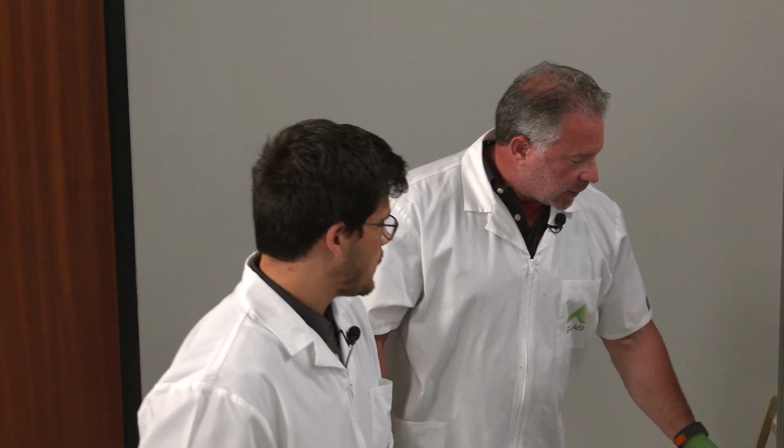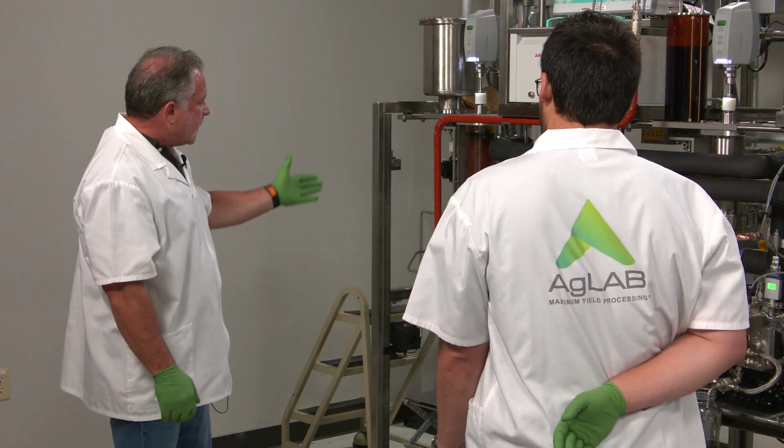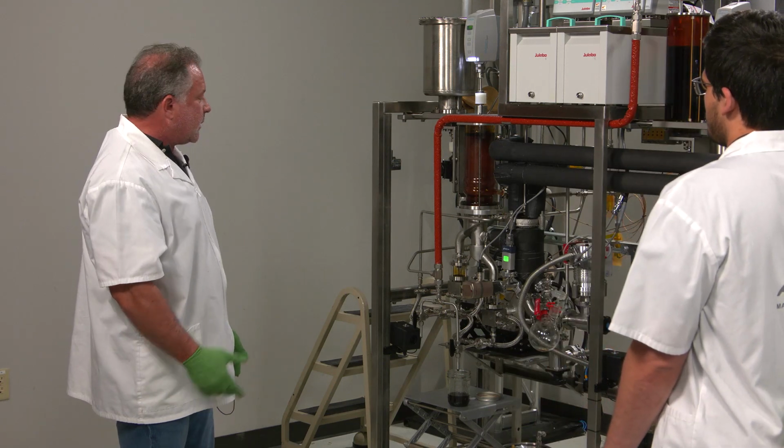Let's go ahead and take a sample. Okay. So one of the things that we're going to do is look for cannabinoids in this sample. Let's take a sample of the heads, the lights coming off of this, and see what we come up with.